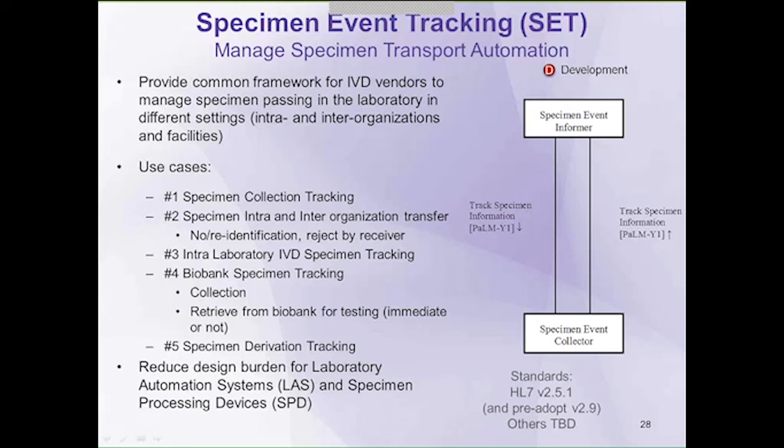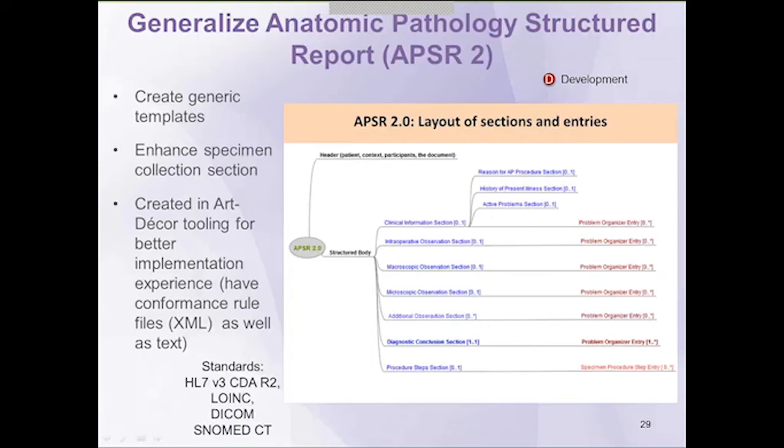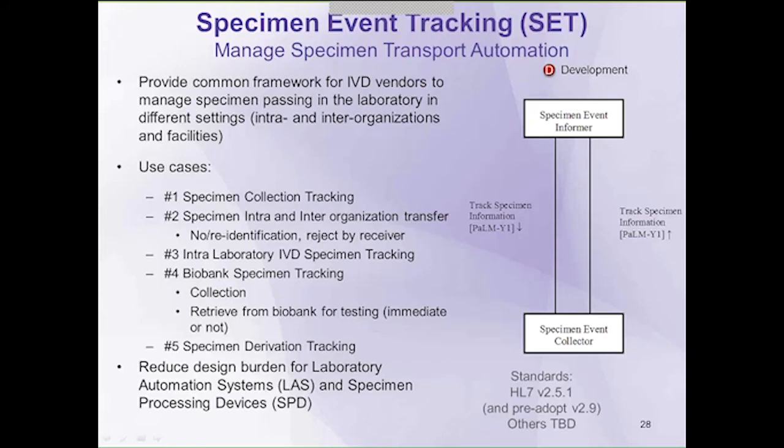And obviously it would need to interact with a number of other profiles, such as the label profile, LBL, the LTW profile, the point of care profile, as well as the automation profiles, LDA and LAW. There's also other profiles in development in terms of anatomic pathology and the digital workflows, which I'm going to speak a little bit more about in the coming slides, and this will touch really all of them, as this touches the specimen, and specimens are part of many other profiles within IHE. So we can go to the next slide.